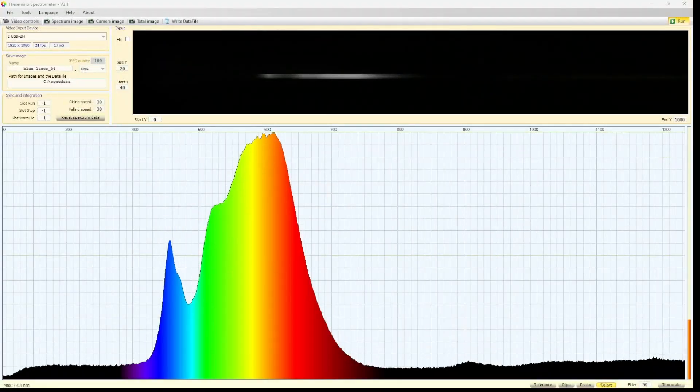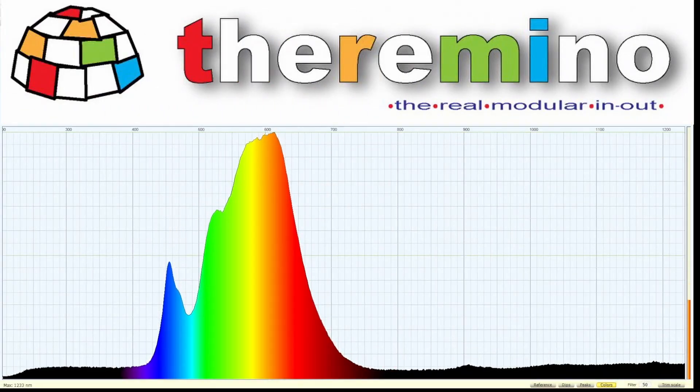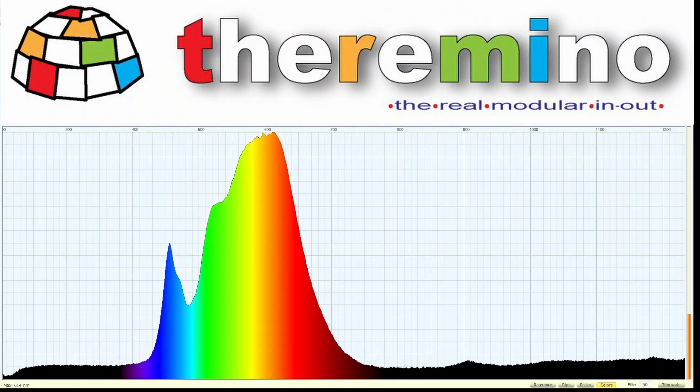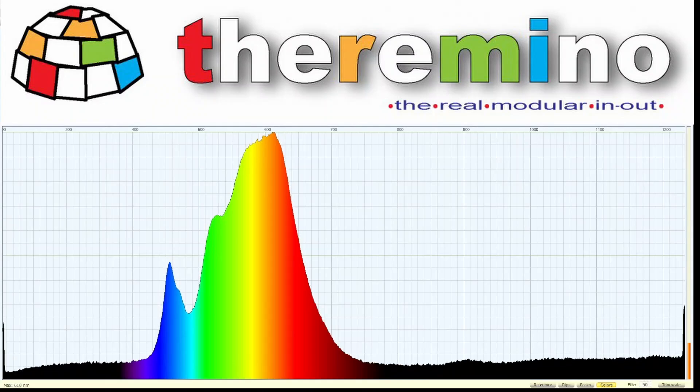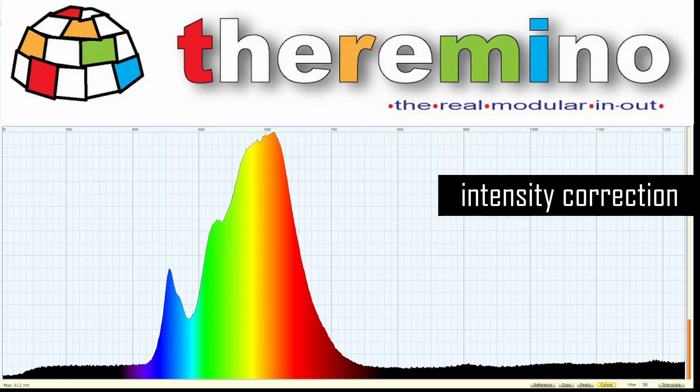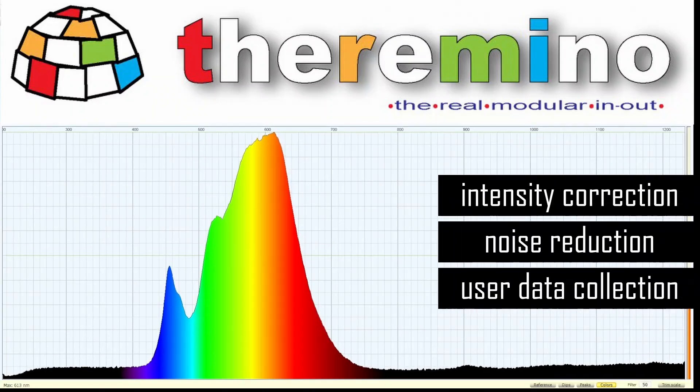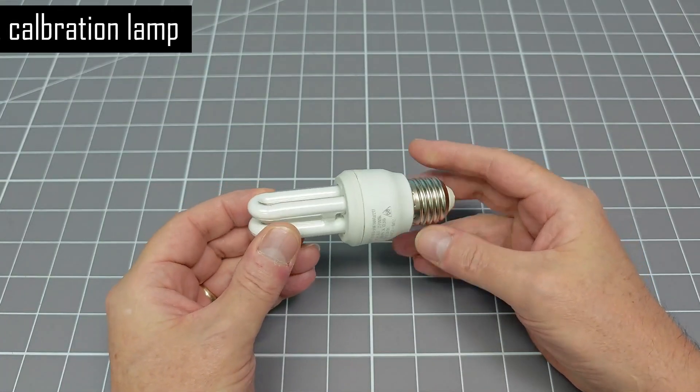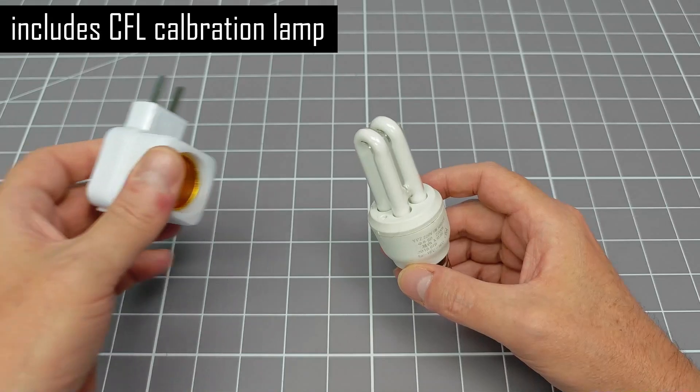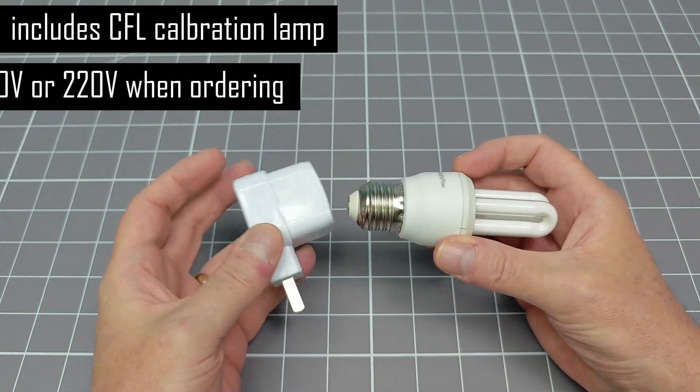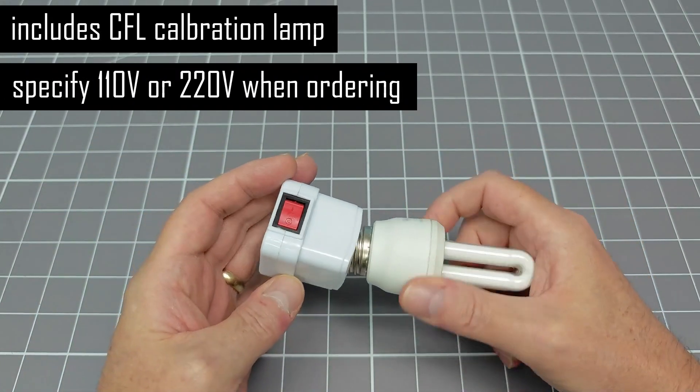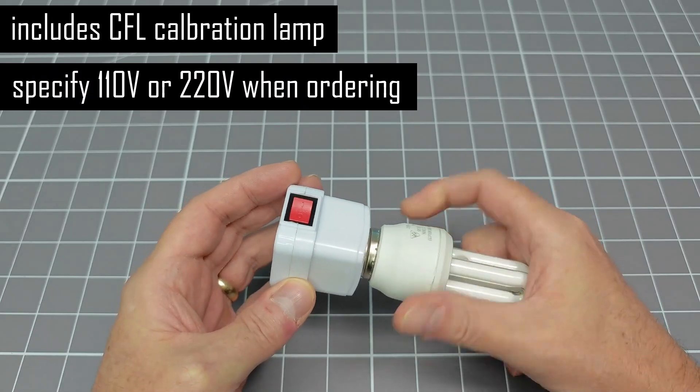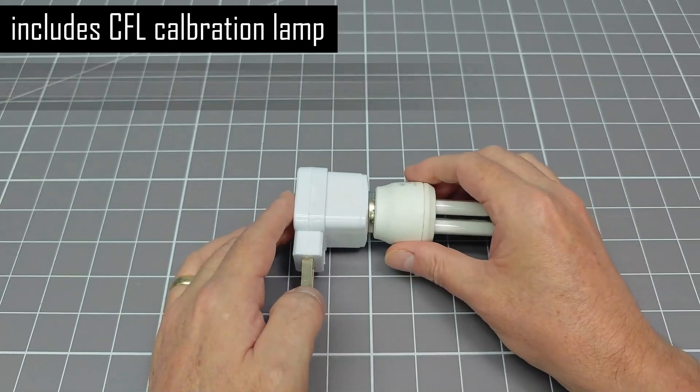This device uses the Theramino software, an open source spectrometer project. Again, the creator of this device has added new features to this. His upgrades include intensity correction, noise reduction, and features that allow data items like CRI to be calculated. Included with the product is a compact fluorescent lamp and lamp holder. This is used to calibrate the spectrometer. In future, the creator plans to add multipoint calibration to improve the spectral accuracy even further.